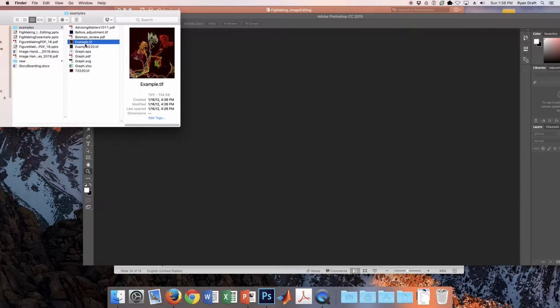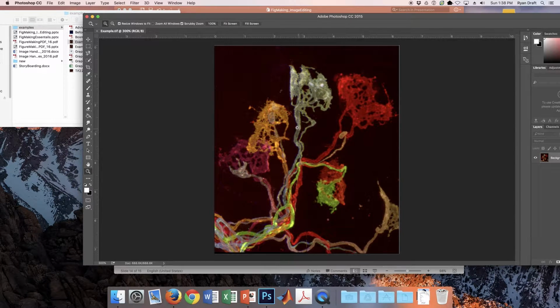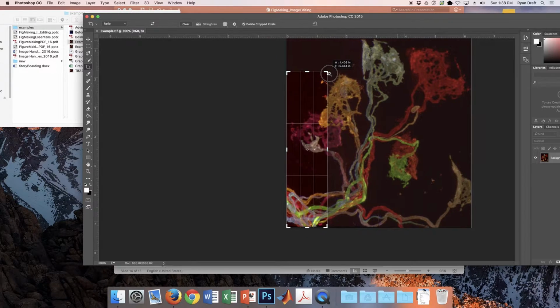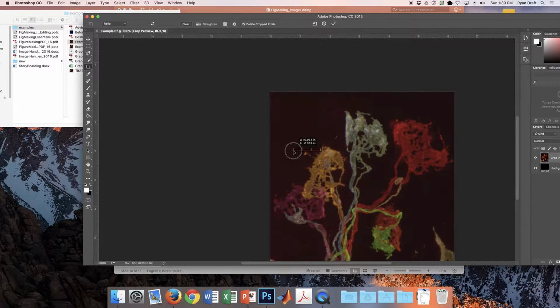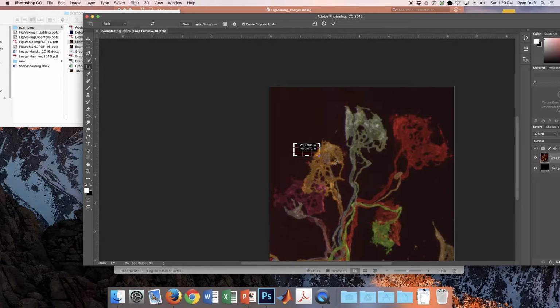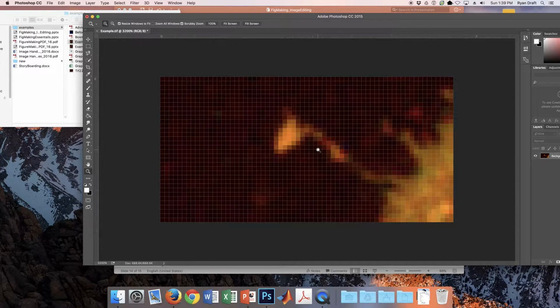So let's open that original image in our image editing program. Let's crop a tiny piece of it that we're interested in. So this little protrusion off of this synapse. And we're going to crop it, and we'll zoom in. And when we zoom in Photoshop, it's preserving the original pixel information that's there.